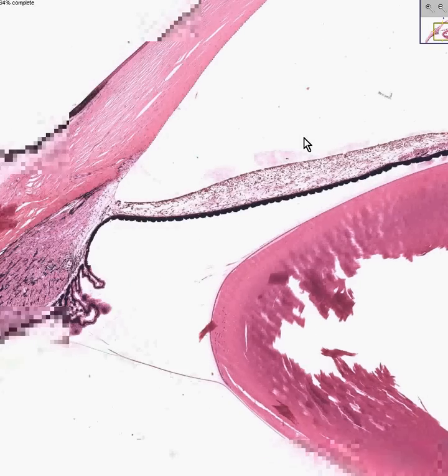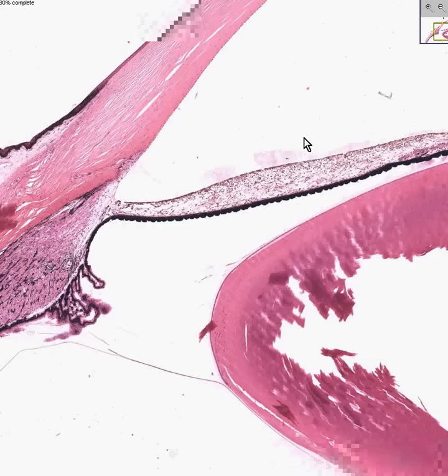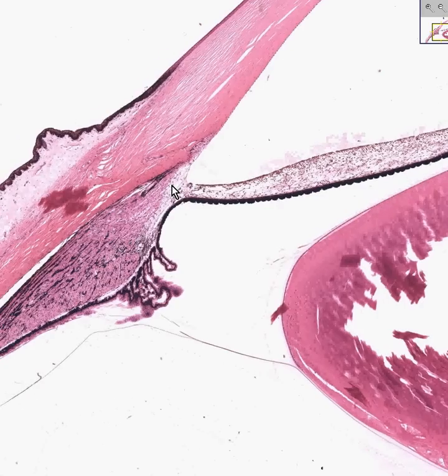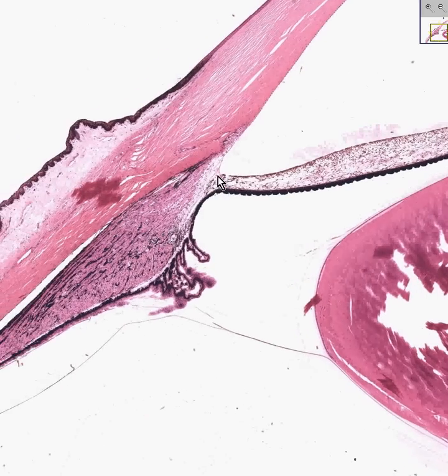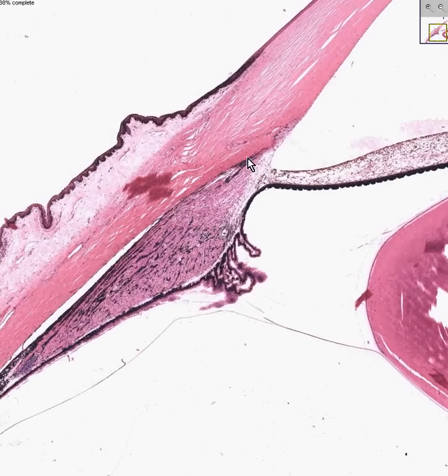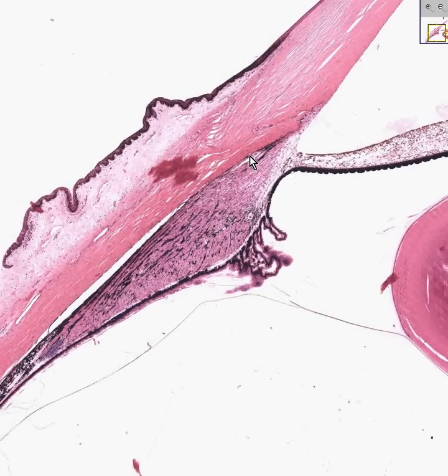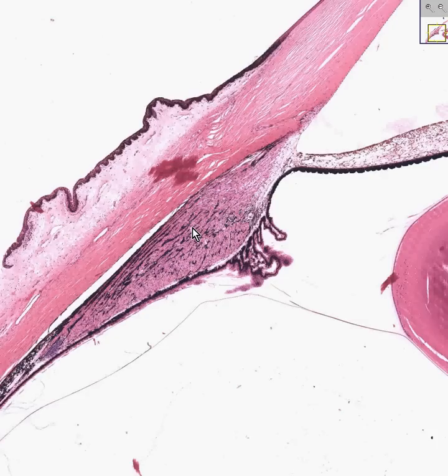But really, you could always look at the retina and talk about the various types of cells in the classical layers, the granular layer, the inner granular, the outer granular. I don't believe in that kind of stuff. I think when you see a retina, you need to know the five or six different types of cells in classical layers you could get there.